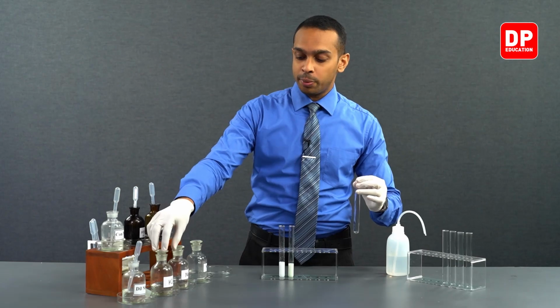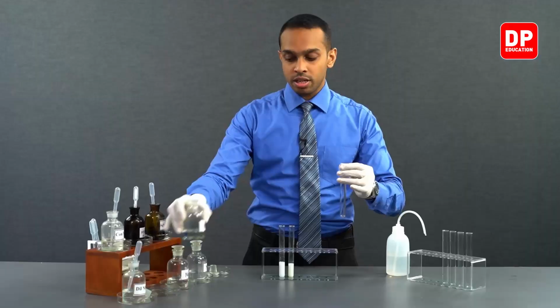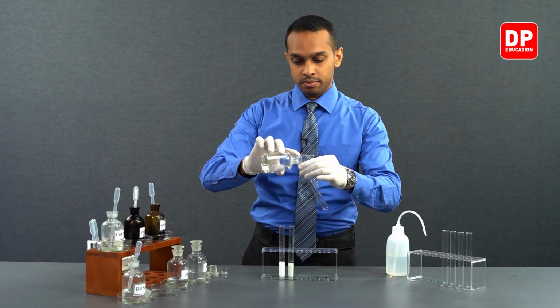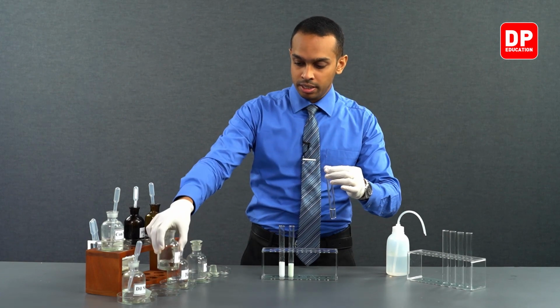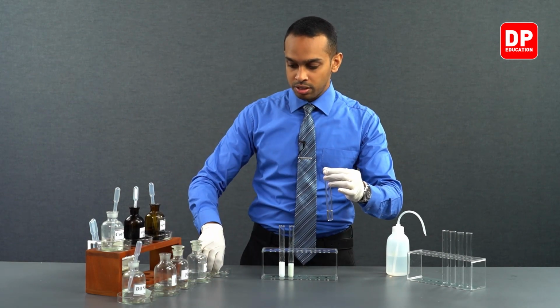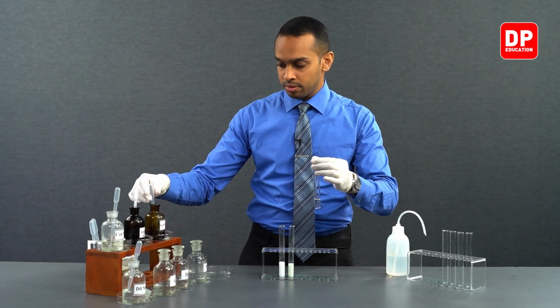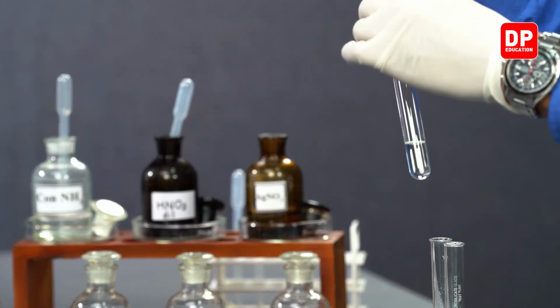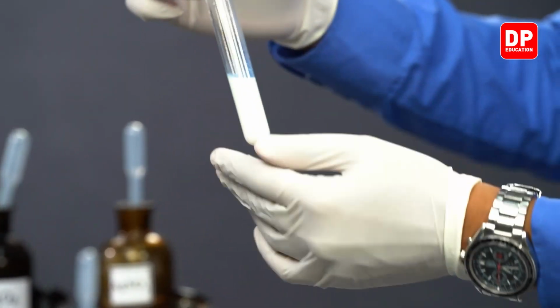If you take potassium iodide and react it with silver nitrate, you will be forming a yellow color precipitate.